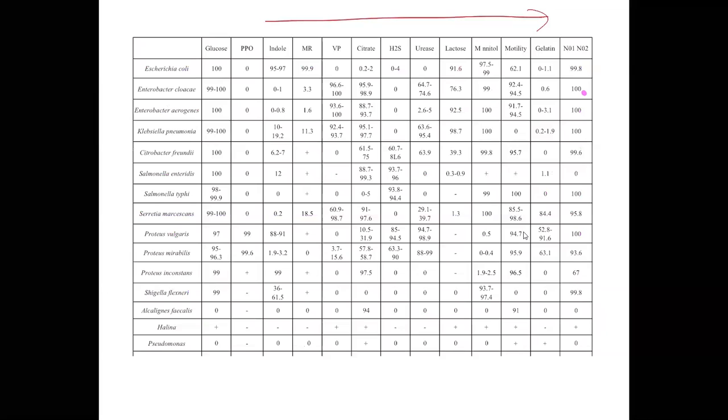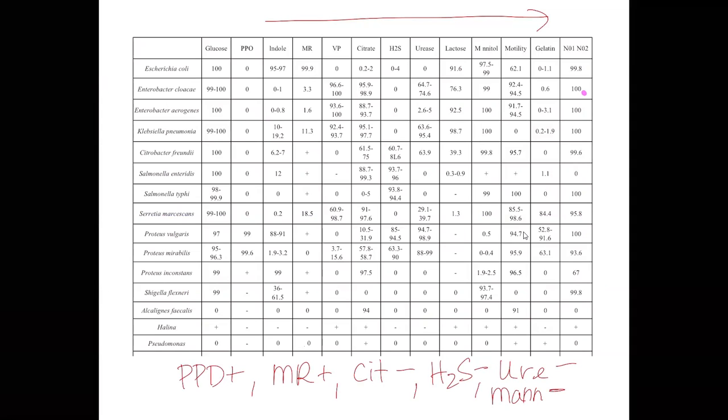Okay, so let's do another one. And let's say this one, the PPD is positive. The MR is positive. Citrate is negative. H2S is negative. Urease is negative. Mannitol is negative, and nitrate is negative. Okay. So let me get the highlighter again.